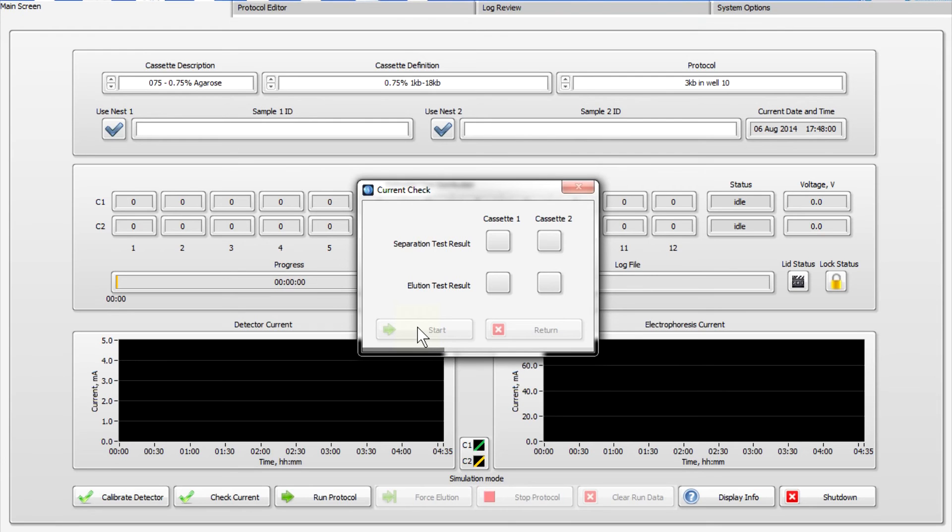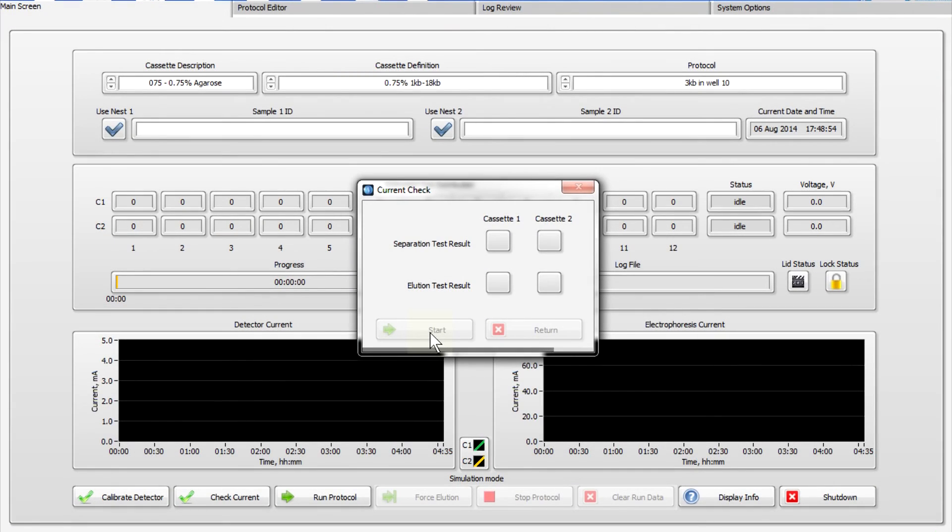The most common causes of current failure are buffer related. If you experience a separation failure, top off the cassette with buffer. If you experience an elution failure, replace the elution well buffer once again. If you get a second failure, contact Sage Science Support.